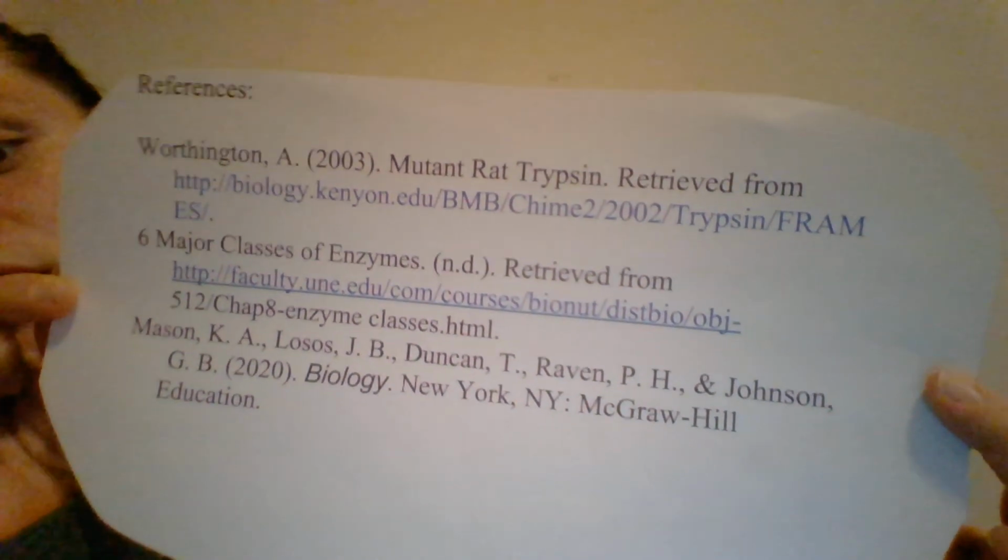Our final result for the experiment, along with the surrounding groups testing pH levels, expressed that trypsin operates best at a pH between 8 and 9 and a temperature of about 37 degrees. And then lastly, just like trypsin, bacteria has ideal conditions for growth. And so that's why this experiment can relate to bacteria and what we will do with it in the future. That is all. Thank you so much. And these are the references that were used in the introduction. Thank you.